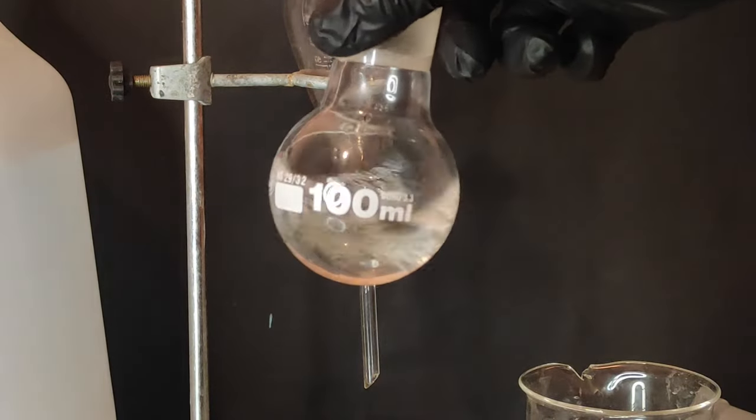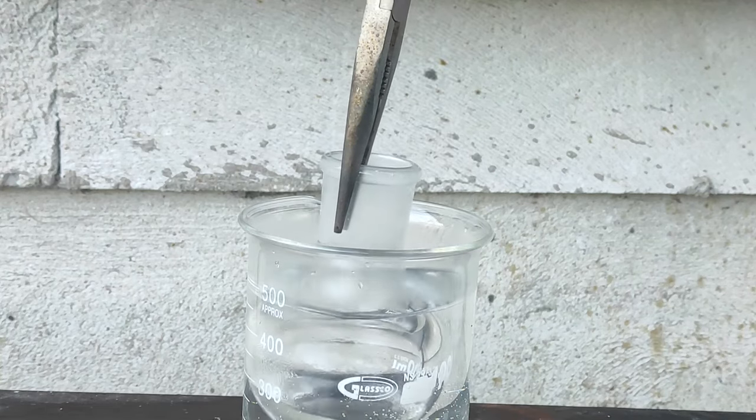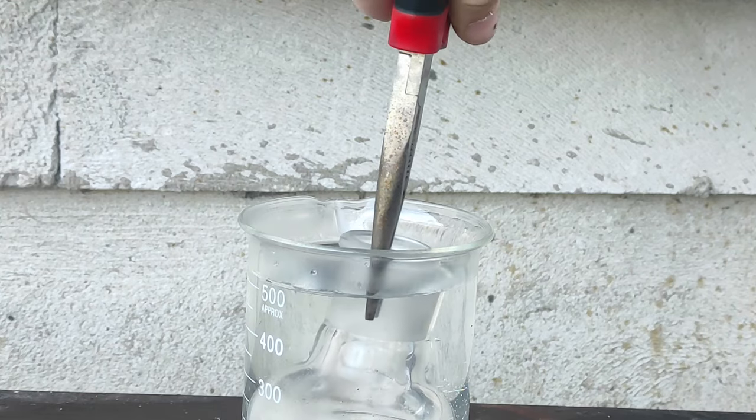Theoretically most of the nicotine should have passed over into the ether layer. Now is the fun part, which is evaporating the diethyl ether. Diethyl ether has a boiling point of around 30°C, which means it very easily evaporates.